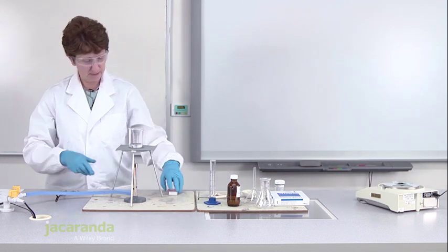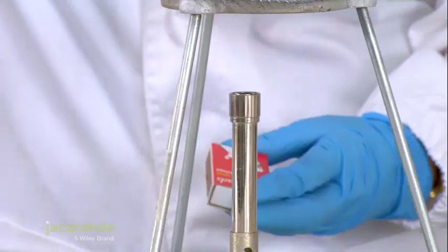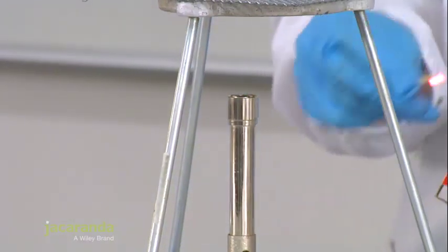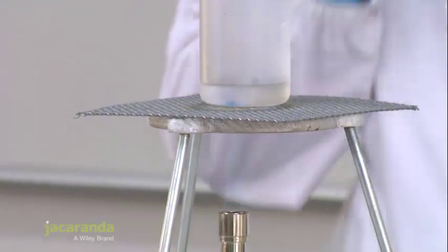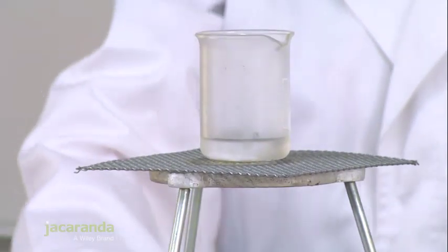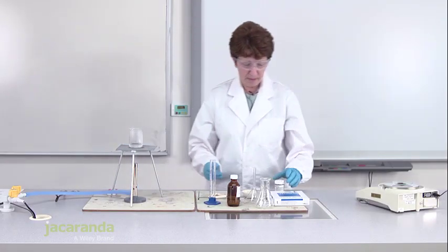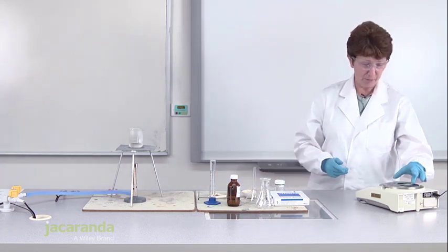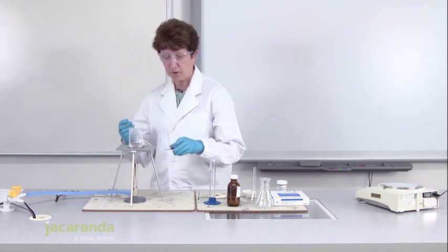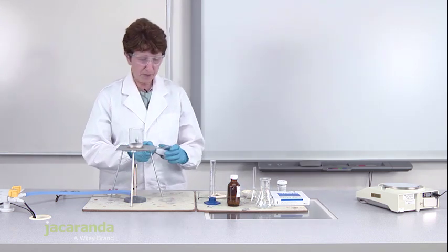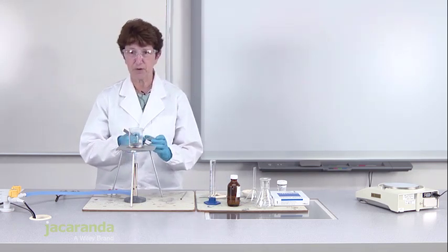We're going to warm that sulphuric acid. That has to be heated to just below boiling point. Then we're going to add our copper oxide to the beaker. We're going to use a spatula to add our copper oxide, and then we're going to use a stirring rod to stir the copper oxide into the sulphuric acid.